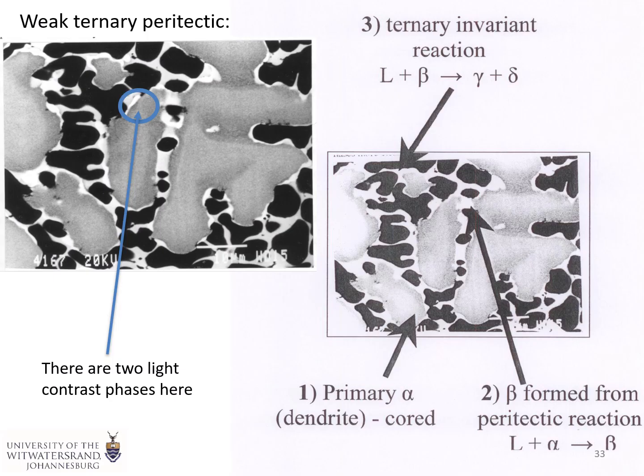And here's a similar one. I must admit this stumped me because my student brought me something like that, which looked like dendrites, and it didn't make sense from our other results. So then I said, no, this is rubbish. I need a lower magnification micrograph. And you can see that this is dendrite.